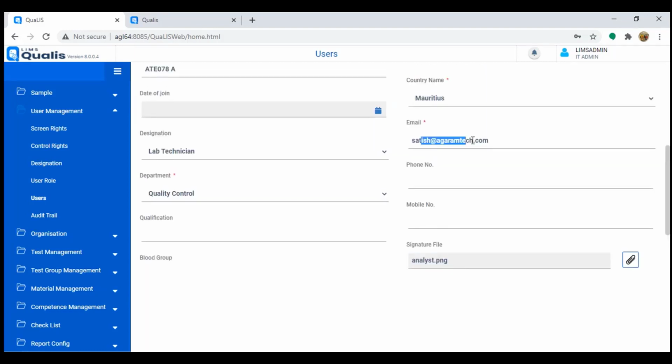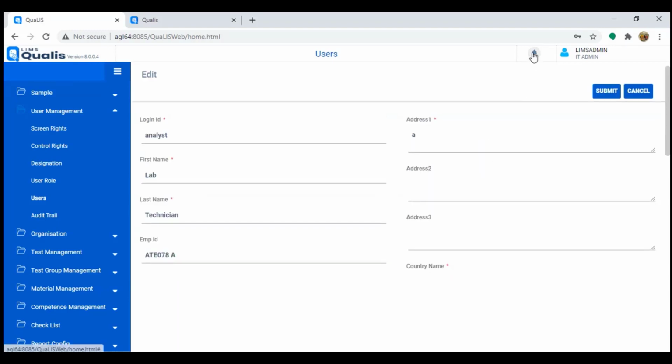Of course, there is also email. We may use it for sending the alerts. As I said, the alerts are displayed here. They can also be sent by emails, so people won't miss them even if they don't log into the LIMS. That is the purpose, right?